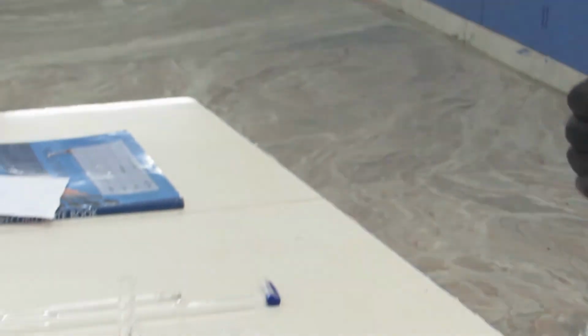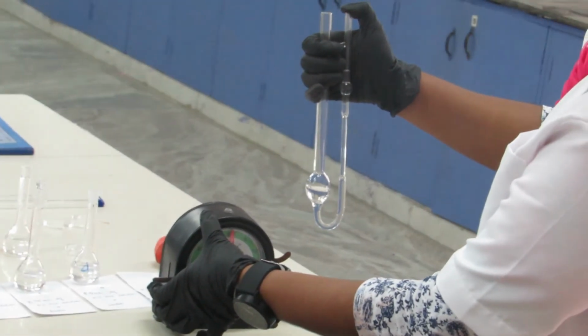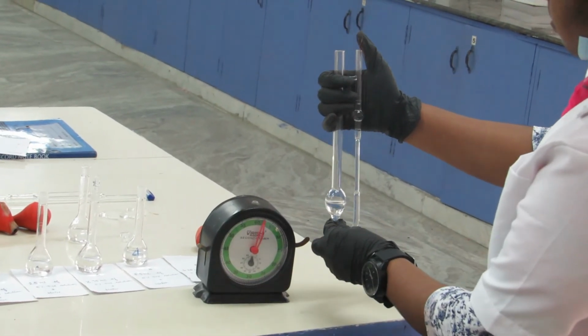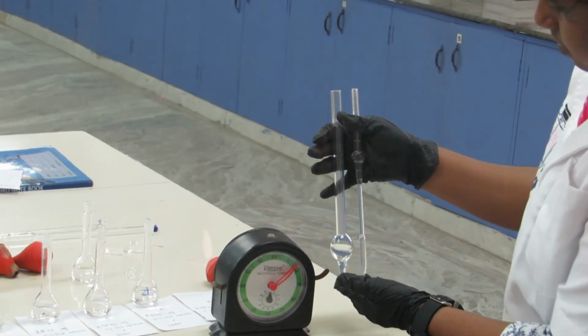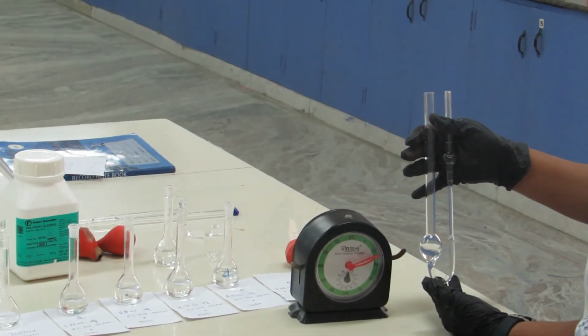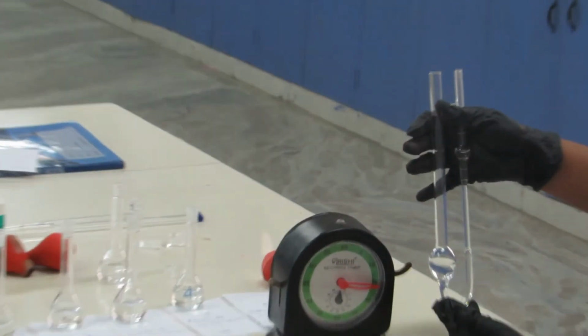If you release both at a time, now you can see the PVA solution reaching the second mark. Exactly at that time you should switch off your stopwatch, and we have to count the flow time, or see the number of seconds on the stopwatch.